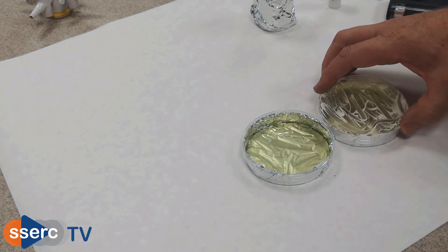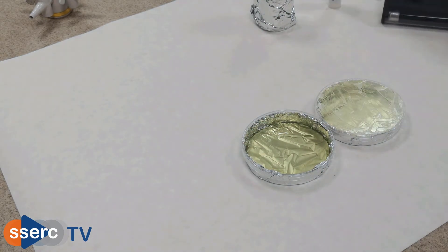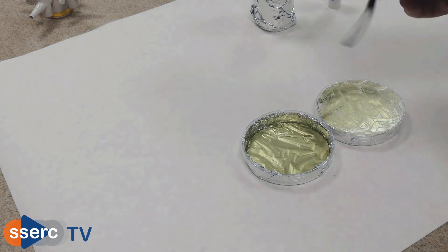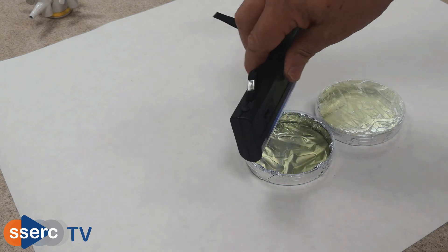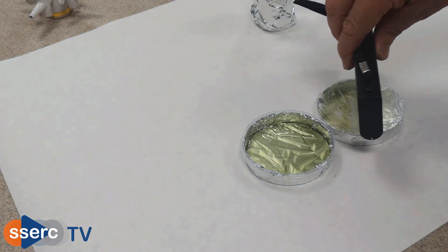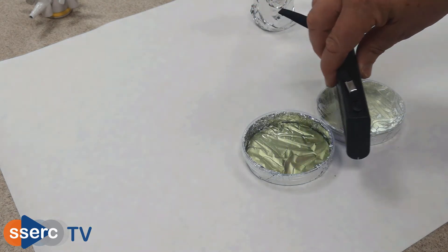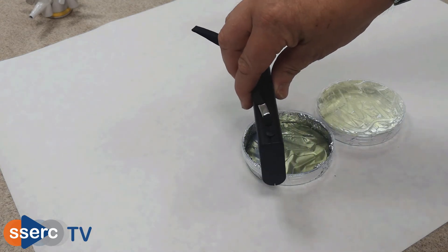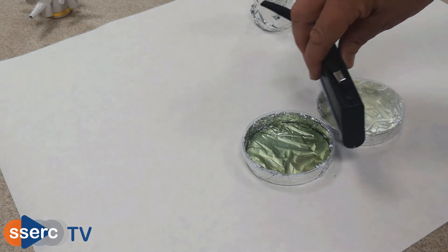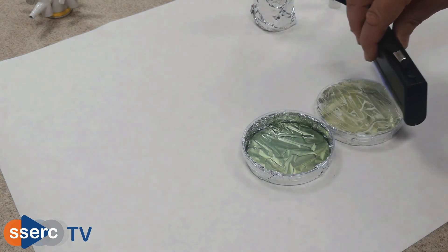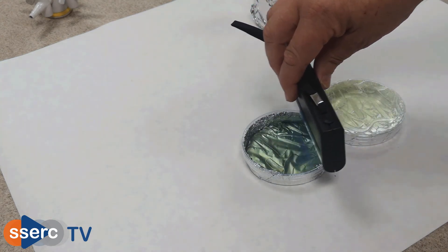Now put the lids on and set about exposing them to the UV light. If you don't have access to a UV lamp just place them on a bright windowsill. It may take longer but will certainly work. If you do have a lamp, like this one here perhaps, then try to ensure that all the dishes get roughly the same exposure. You can see I'm moving the lamp about over the dishes, keeping it at the same height as far as I can.